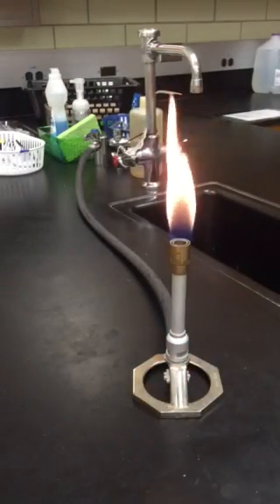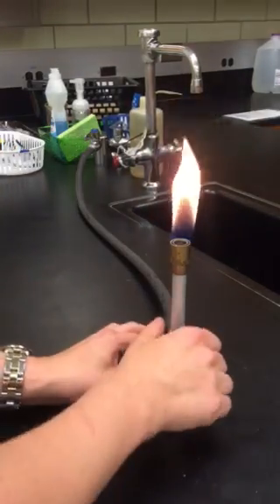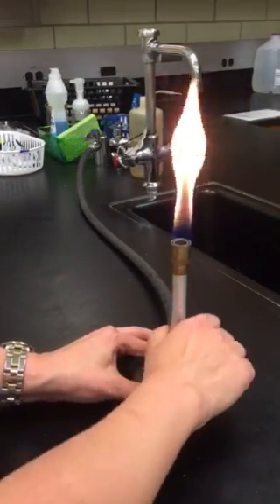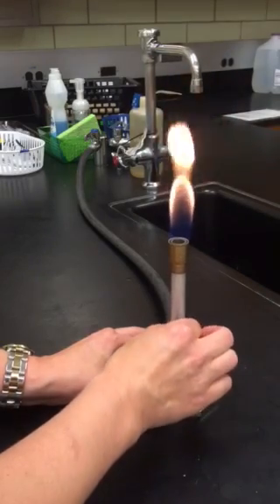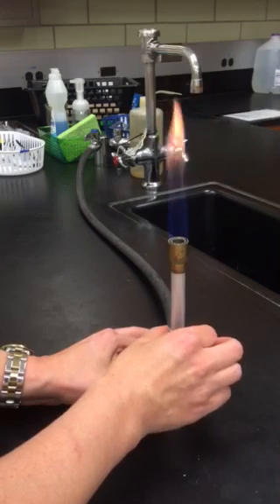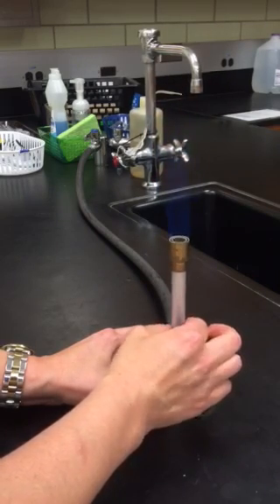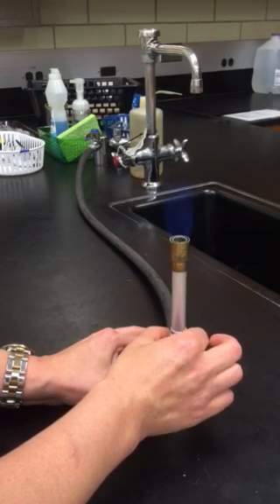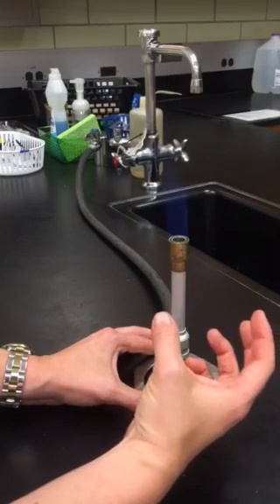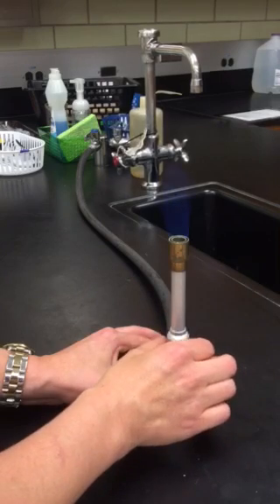Now I'm ready to optimize it. What's going to happen is I'm going to try to get all of this yellow color to disappear by creating a really fuel-lean flame, which means that I've got a really good mix of oxygen and just a moderate mix of fuel. Notice as soon as I start twisting my barrel to the left, I have reduced the color of that flame, but I'm going to keep going because this flame is not good enough yet.